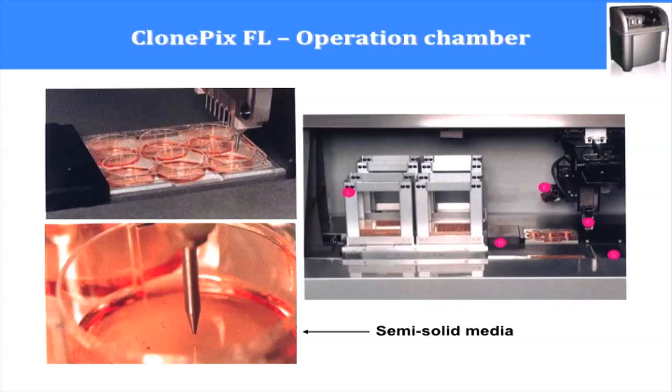Okay, so this is what you see when you open it. We have the picking head here with 8 pins on it. And then we have 4 positions for 4 stackers. The back 2 stackers are for what we call the source plate.